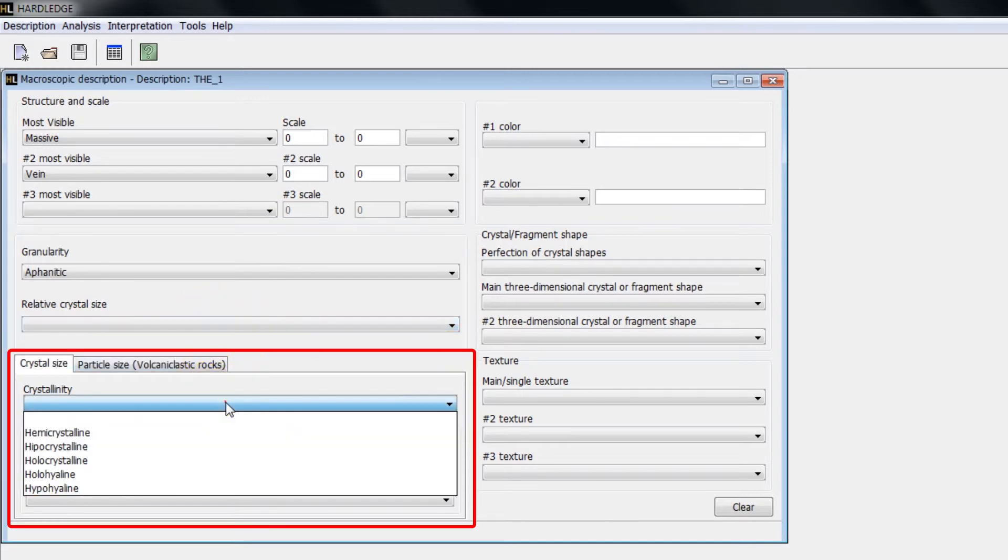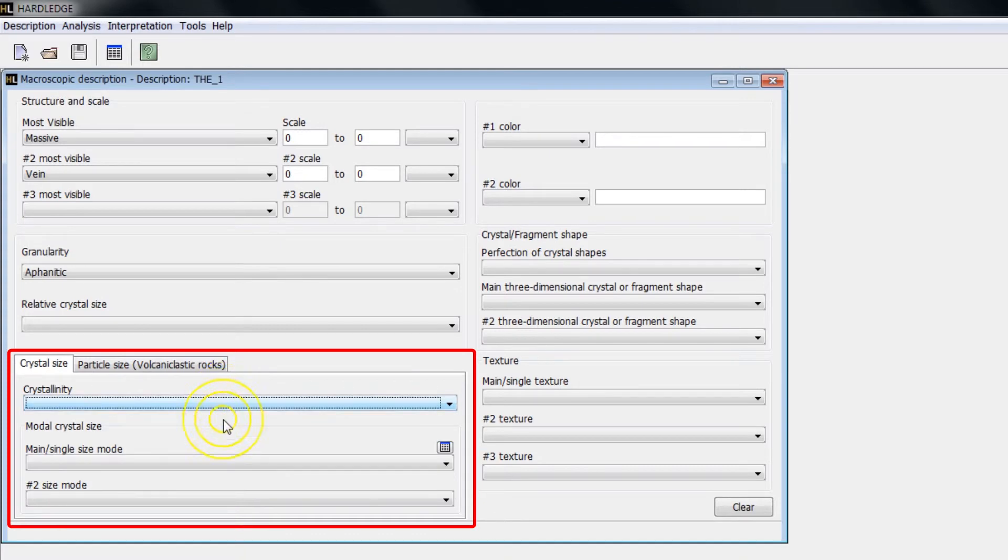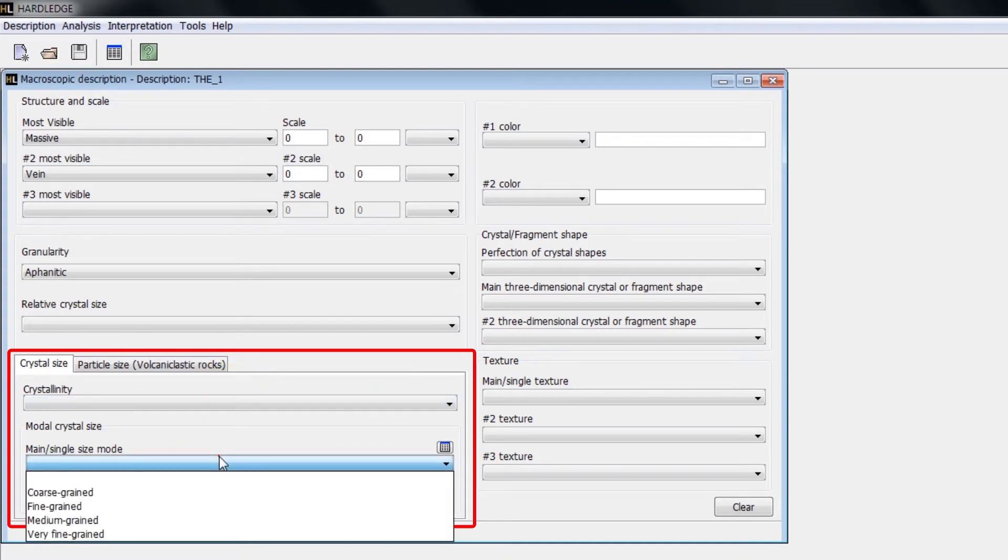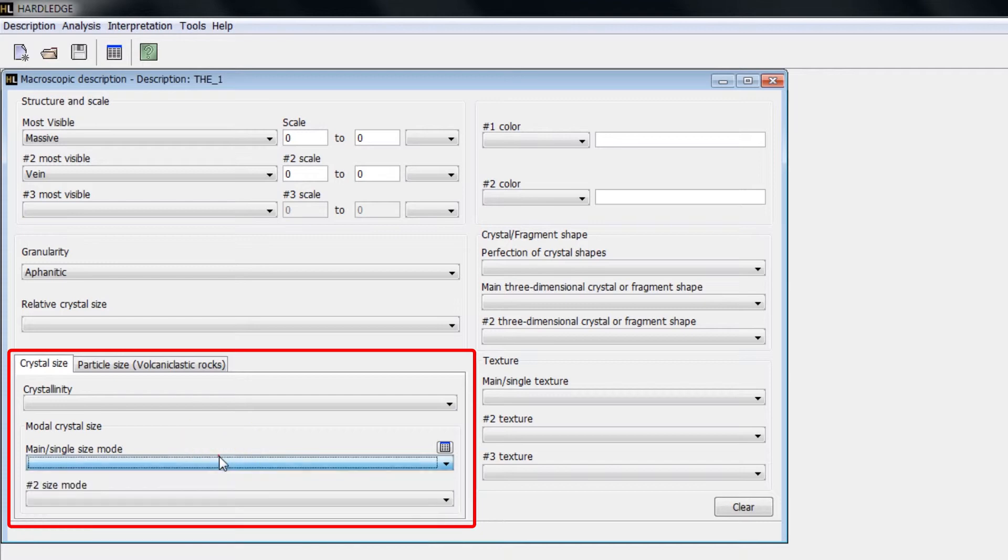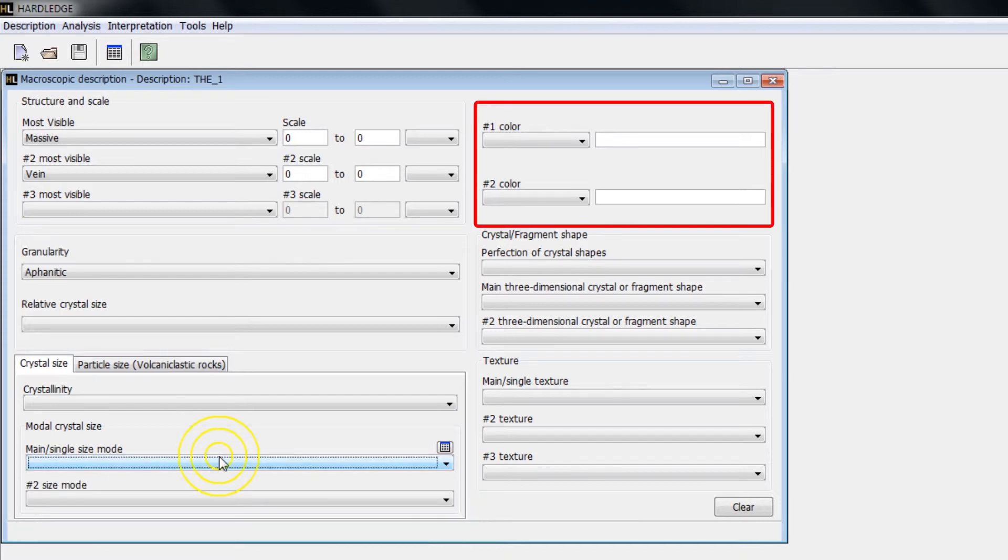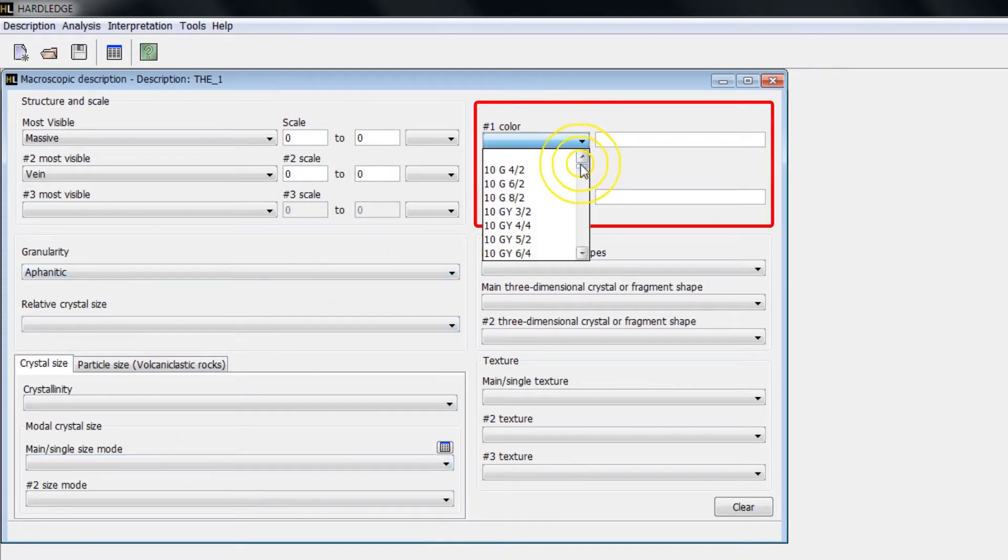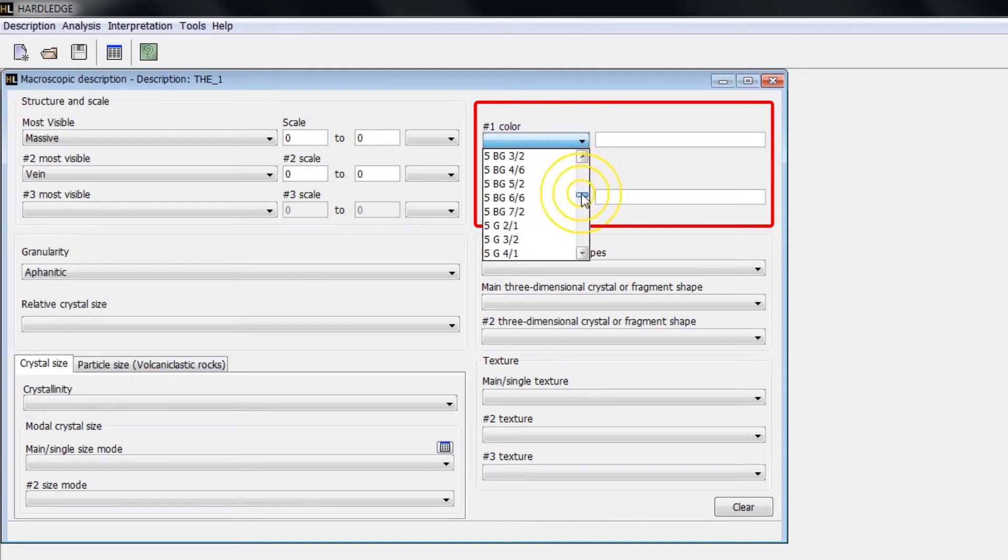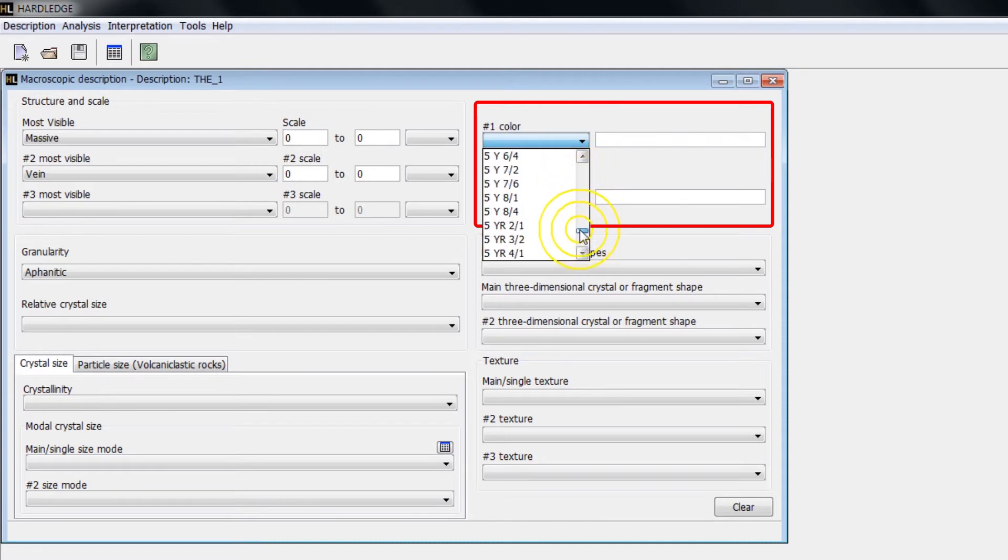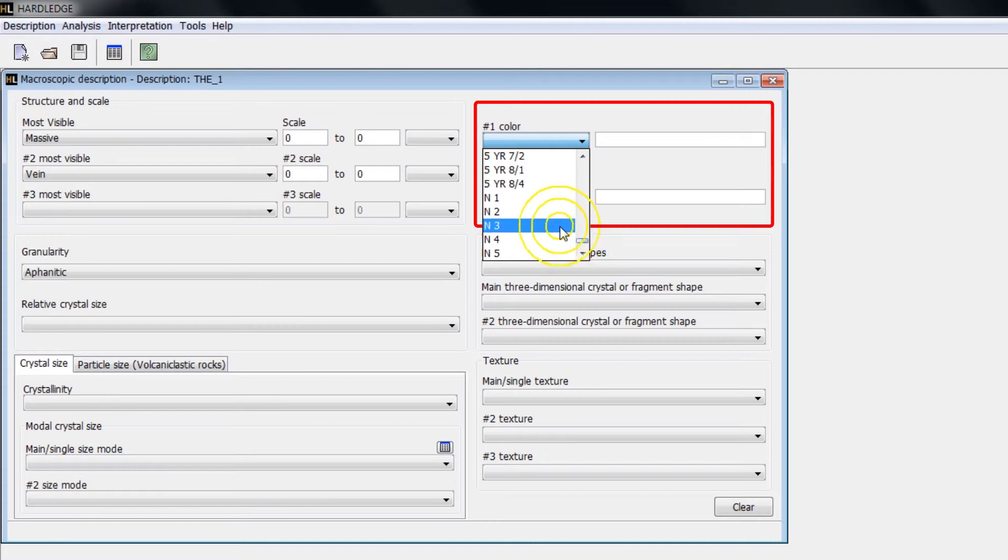In Crystal Size, the crystallinity, the only or main modal size of the crystals, as well as a second modal size, can be informed. To insert the sample color, click on Color and select the desired AGI Rock Color Chart code or type the name of the color in the text field. You can select two colors.